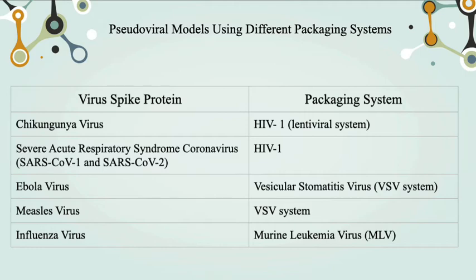It is ideal because it has no stringent selectivity for envelope proteins. When this packaging system is used to make pseudovirus, there may be residual VSV which is mixed with the pseudovirus, and this can produce a false positive result. Therefore, the amount of VSV used should be minimized.